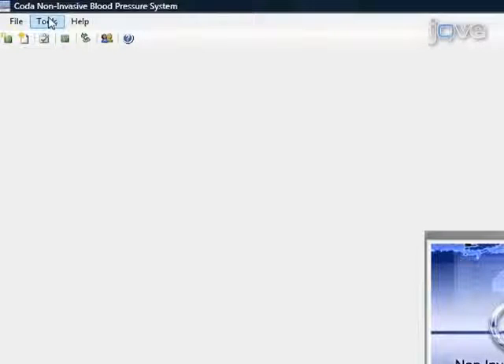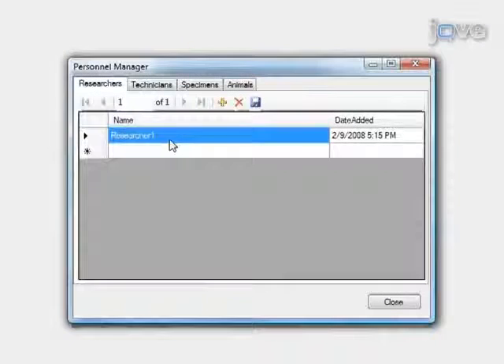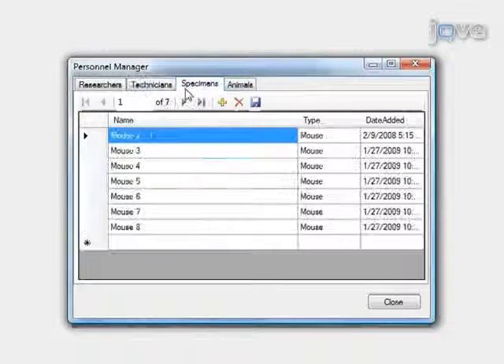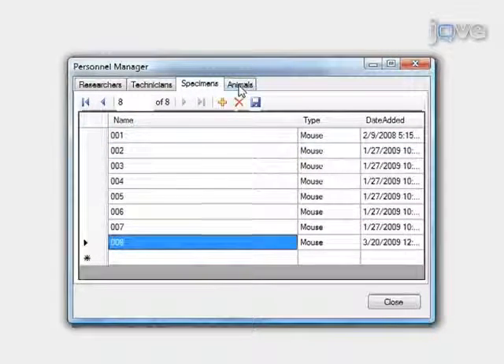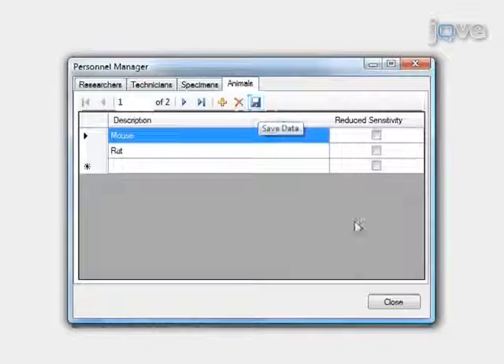To set up the software, select Tools, Manage Personnel. Next, click on Researcher 1 to change the name. Click on Subsequent Rows to add additional researchers, then click Save Data. Click on the Technicians tab to modify or add technicians. After that, click on the Specimens tab to name the animals for easy identification and to select the animal type, then click Save Data. Finally, click on the Animals tab to alter the animal type and sensitivity. Click Save Data and then Close.